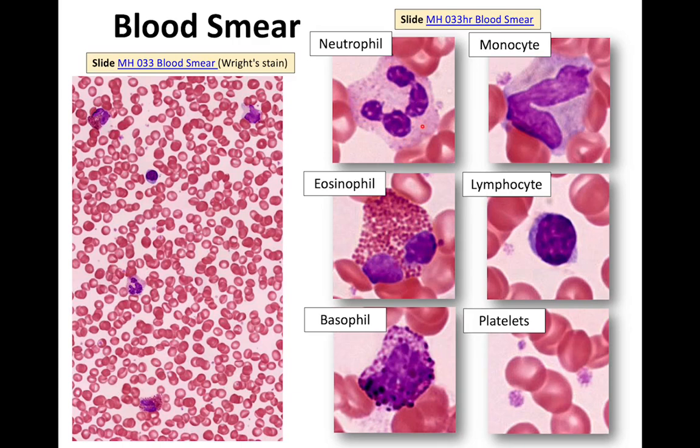Neutrophils are the most abundant ones, and their granules are neutral. That's why they are known as neutrophils. It's not either eosinophilic or basophilic, it's neutral. The main distinguishing feature of neutrophils is that the nucleus is multilobed. It contains 2 up to 5 lobes. And with eosinophils, as their name indicates, the secondary granules are eosinophilic. So they appear red or dark pink, the same color as the red blood cells, and the nucleus is bilobed.